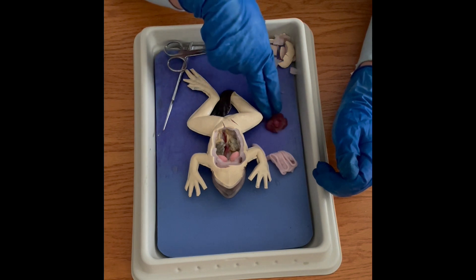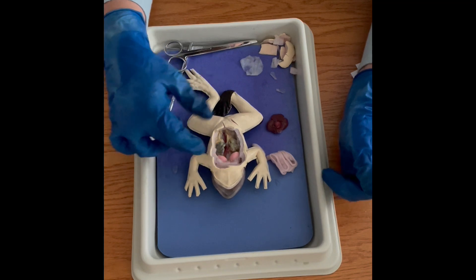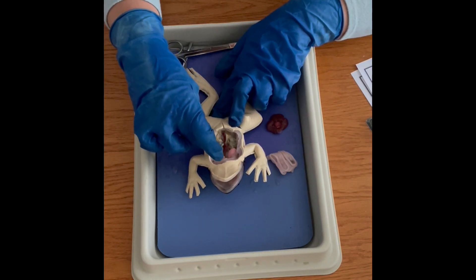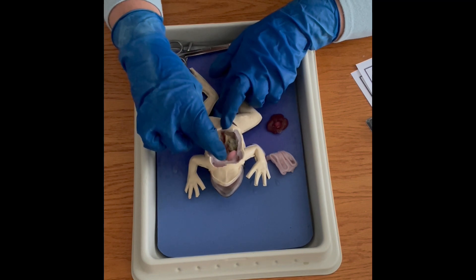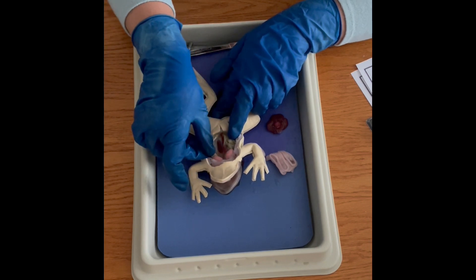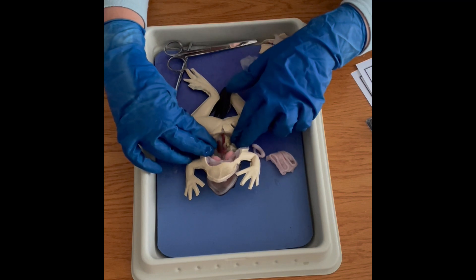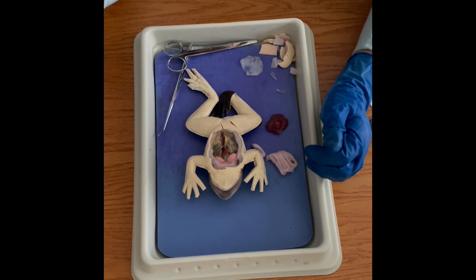I pulled out the three-lobed liver and the heart, so you can see the lungs in there. You can see the ovaries full of eggs — I'm not sure if all of these are female or if they make male and female versions, but you can certainly see the eggs and the oviducts leading down to the cloaca. The kidneys are visible in the back and those lead down to the bladder and the cloaca as well.